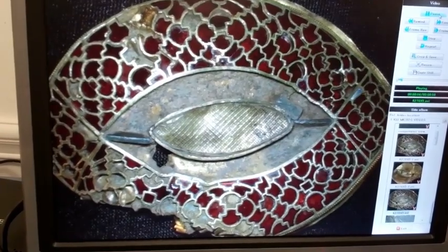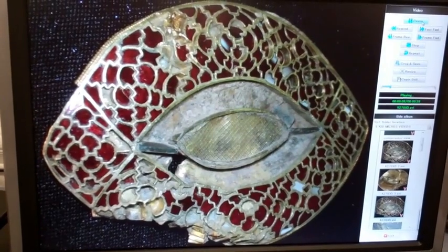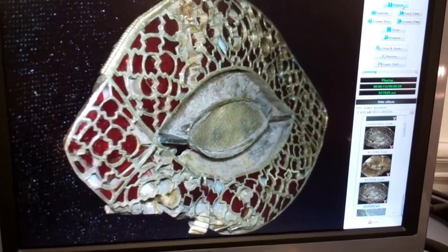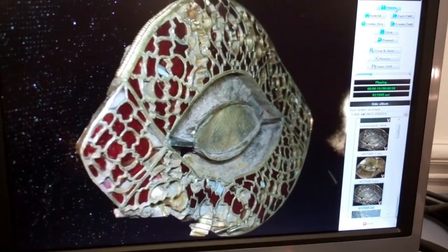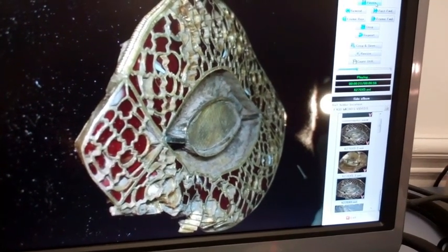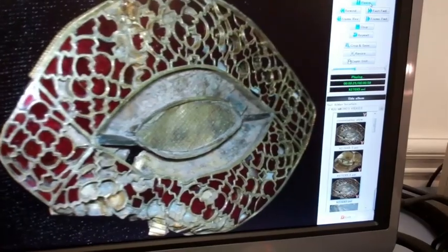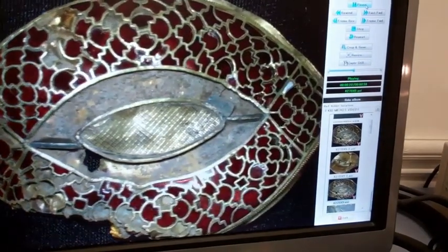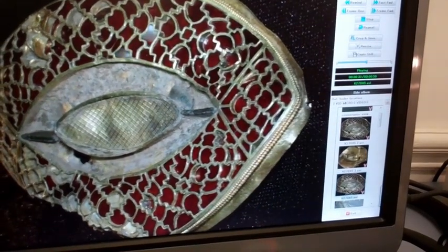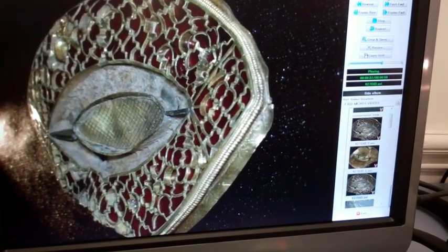This microscope is also capable of taking video, which is just another layer of documentation that we can save for future generations who work with the hoard. The camera is just moving side to side around the object, but it looks as if the object is moving, which is a very true experience of what working with hoard items is like — you don't ever just keep it in a flat position; you always move them side to side to see what's going on in all angles.